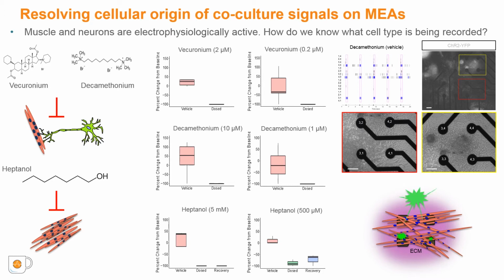After a few days, we add motor neurons on top of the skeletal muscle within an additional protein matrix. This protocol seems to prevent motor neurons from making direct contact with the electrodes due to physical separation, leaving the myotubes as the cell type in contact, although we cannot rule out individual or small clusters of motor neurons contributing to recorded signals.